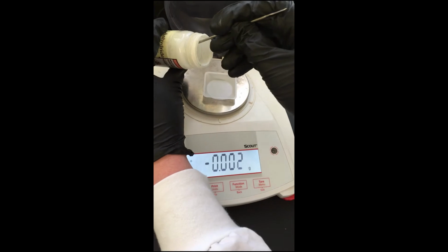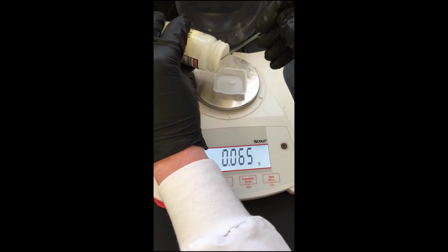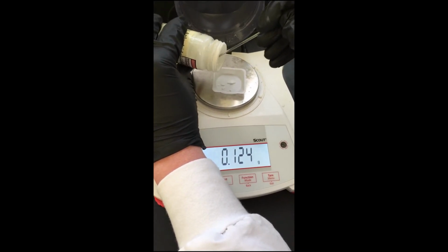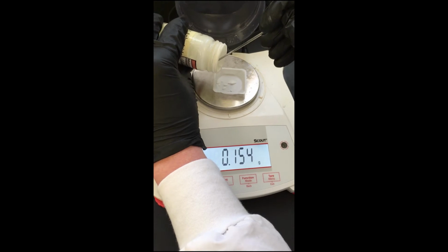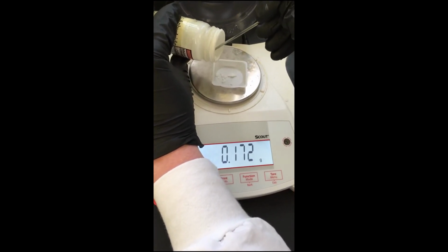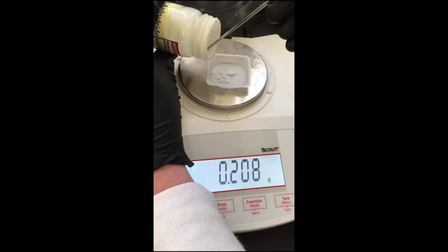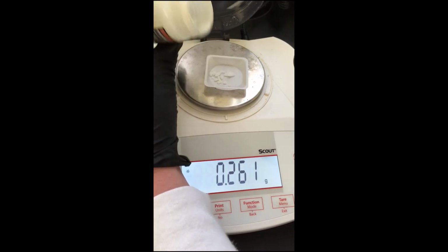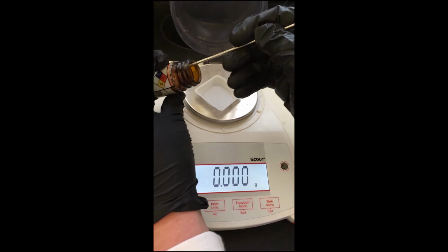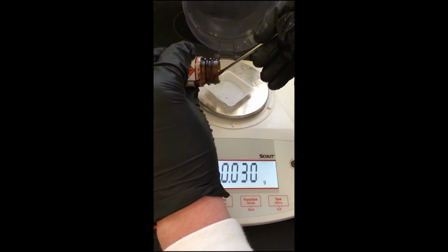All right, so I'm just going to measure out 260 milligrams of this maleic anhydride. And I'm also going to measure out 124 milligrams of the sulfolene.